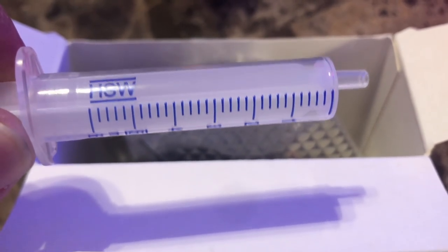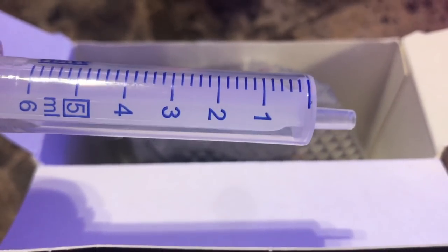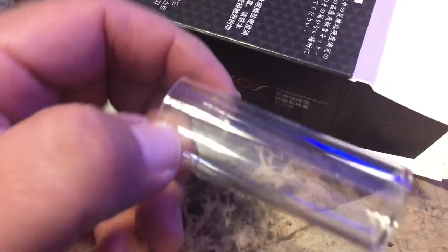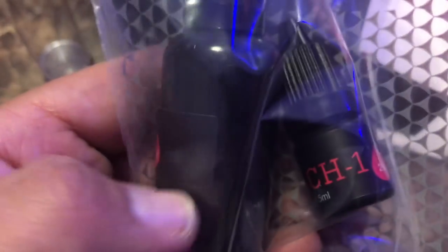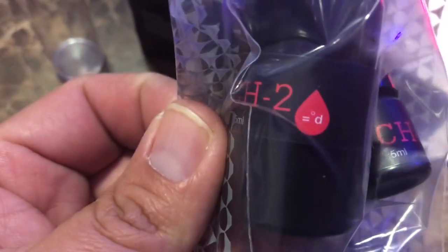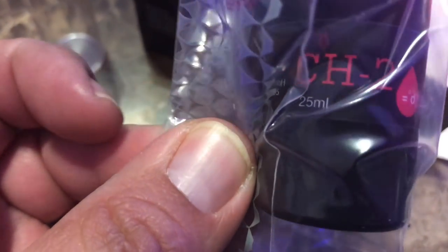Alkalinity is one of those things that you got to keep your eye on. Little swings, big swings could most definitely make a difference. You want to keep things as stable as you can. And that's one of those things that you do got to test out on your reef tank. If you haven't been testing like me, you're going to run into some problems. As you know, I've had bleaching and the corals will come back hopefully. But this test kit is going to try to help me be a better reefer and test and dial in so I can start dosing again.